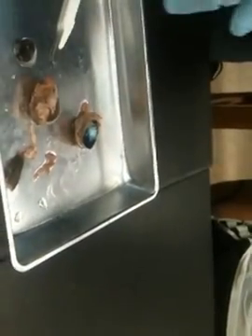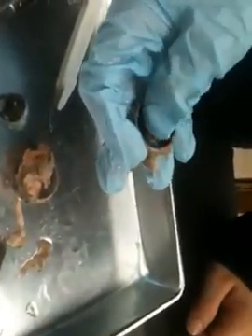It's not the retina, but it's the cornea? No, not the cornea. The choroid. Choroid. Okay, the choroid is the middle layer. And then the retina is this layer on top of it, so it's kind of gotten pulled away here. See this tissue? That's what that was? Yeah, so it usually lays on top of the entire choroid, right? It's that opaque layer, so that's the retina.